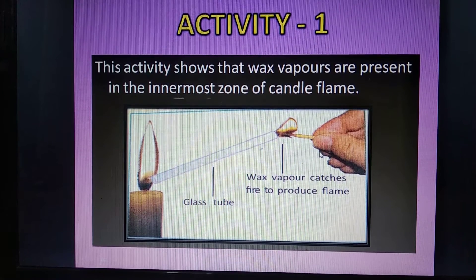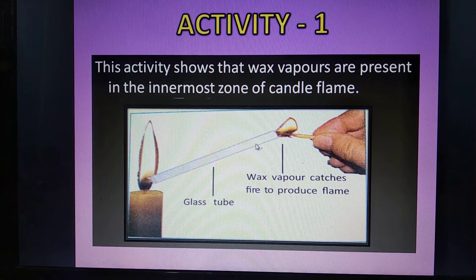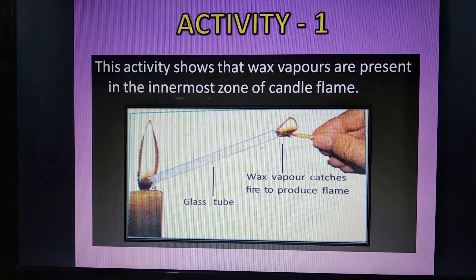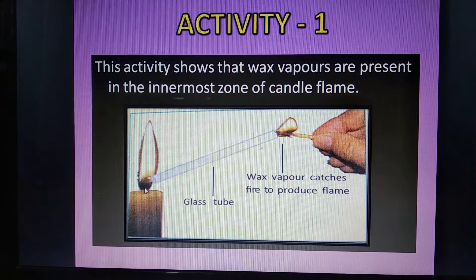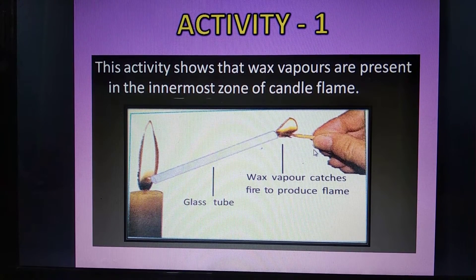Hold a thin glass tube with a pair of tongs and introduce one end of this glass tube into the innermost dark zone of the candle. Now bring a lighted matchstick near the other end of the glass tube. We will see a flame at this end of the glass tube.